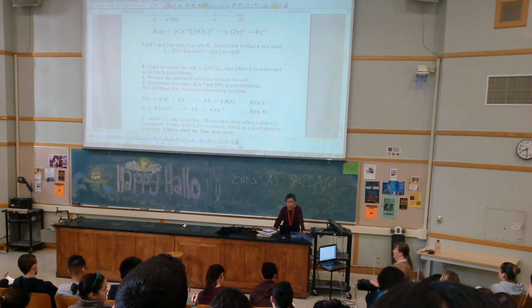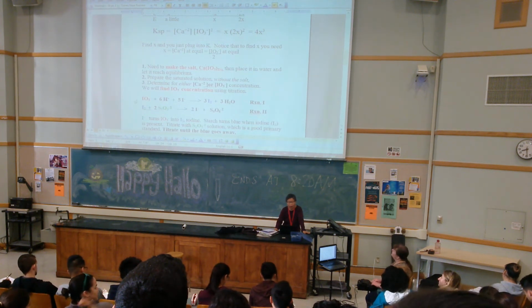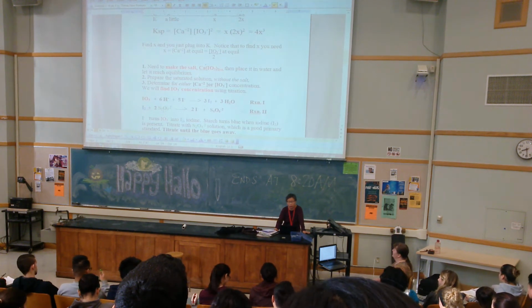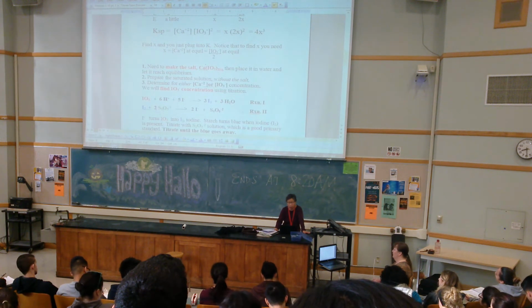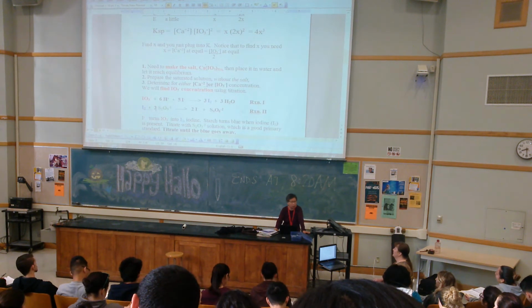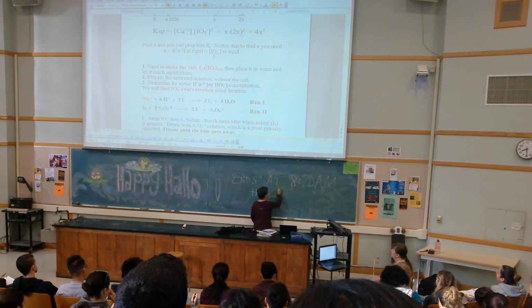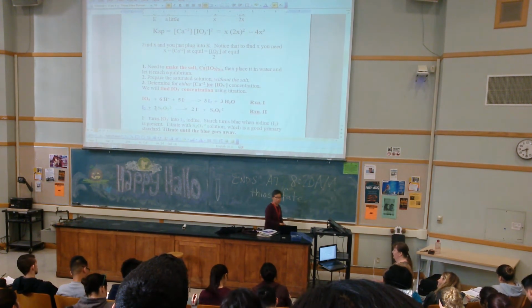Your titration will involve thiosulfate, okay, to determine the iodine concentration. I'll go into detail on that. So circle your thiosulfate. If you don't know what thiosulfate is, write it underneath here. The green one is your thiosulfate. That's going to be your primary standard. Thiosulfate. Okay?